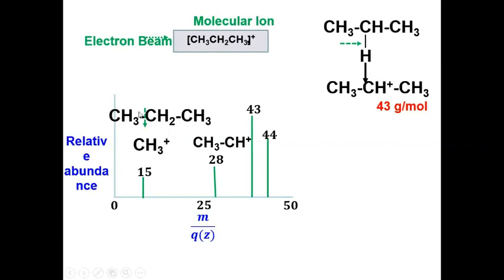Another possibility is fragmentation of propane through this bond, and this CH3 cation will be released from the molecule, and we will get a peak at 15.